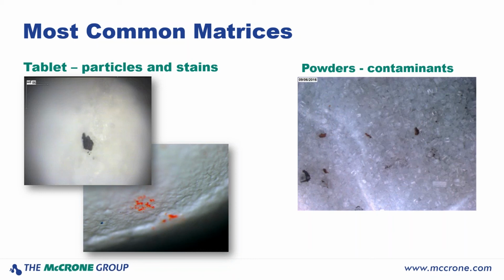So in that case, we're going to go to a clean area of the tablet or some unstained powder. We're going to take that sample and prepare it for our analysis as well. The most common analyses that we do here are micro FTIR, as we mentioned earlier, or SEM, EDS, scanning electron microscopy with energy dispersive spectrometry. Those are our two main identification techniques. We want to be able to attribute any responses from those instruments that are due to the matrix and not the particle appropriately, which is why we're always going to sample the matrix when we can.